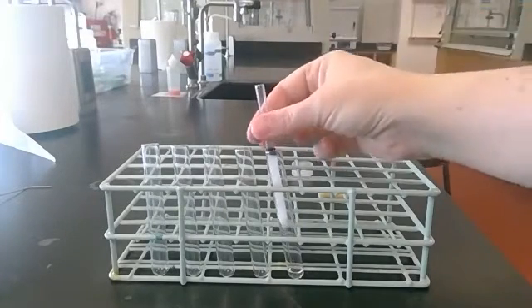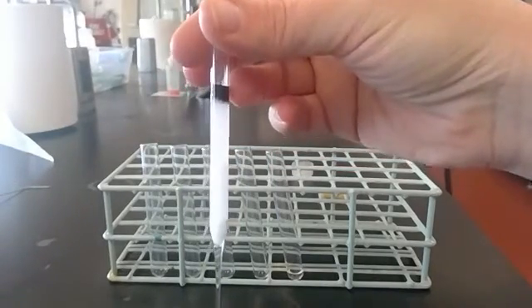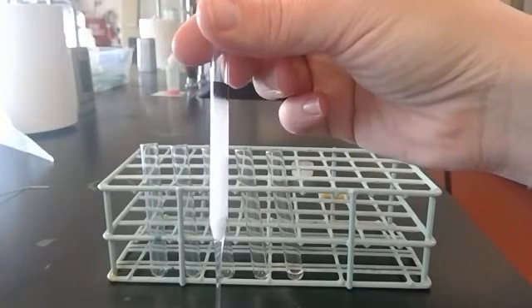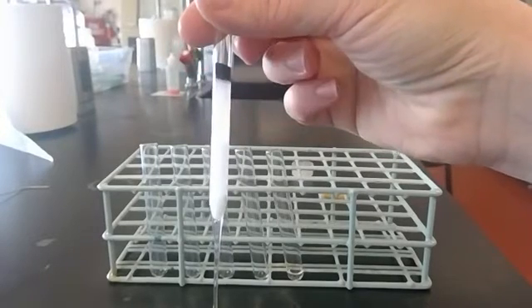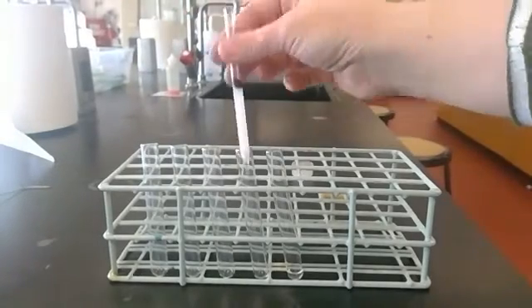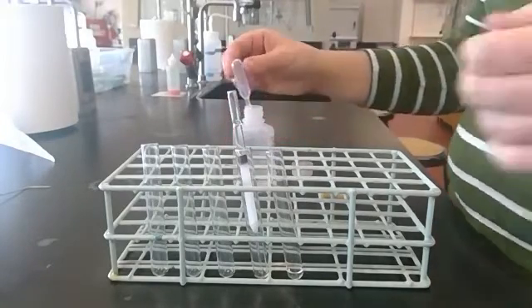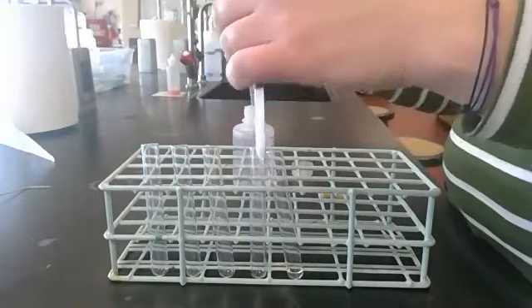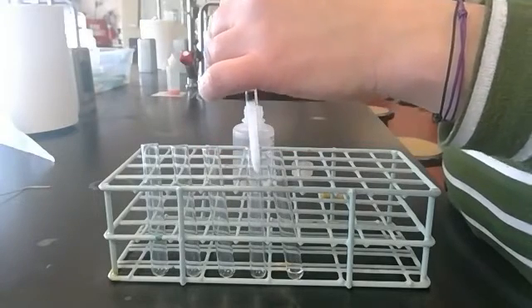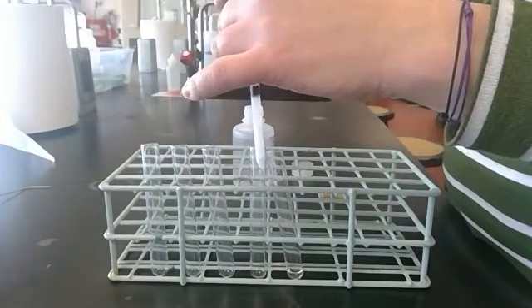And so now, you can see I have my compound I want to separate right here, the purple Kool-Aid that's very concentrated. And I have my silica gel that is filled with isopropanol. And now I am going to put more isopropanol on, layer it on top very carefully so it doesn't mix too much, and then push it through. And we're going to see what color elutes first. So it's either going to be probably blue or red.